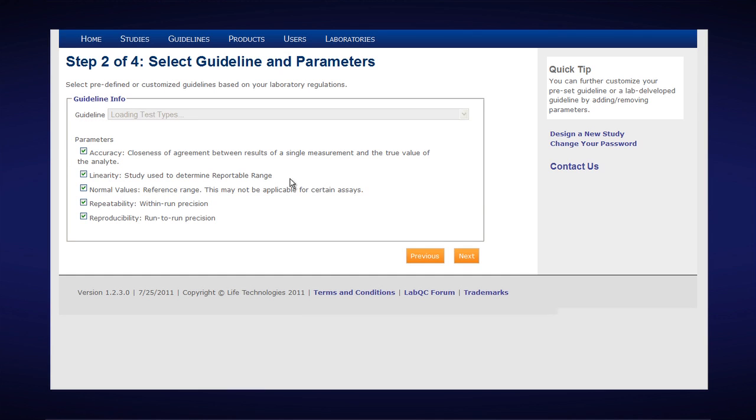Automatically the EZ Validation tool populates the parameters or studies that need to be tested per the CLIR CAP New York State guidelines. We will uncheck, in this case, the normal values since there is no normal value for HIV.